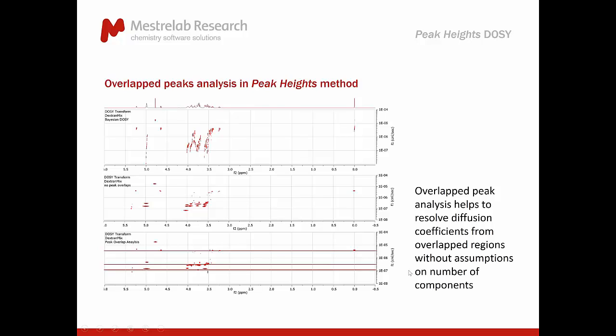What I mean by assumptions is an assumption of how many components you have in your mixture. And the other point to make is that multi-exponential analysis and deconvolution are sort of complementary. They're not interfering with each other, and both can be used. We don't have multi-exponential, but it's something we probably can introduce one day to our DOSY package as well.